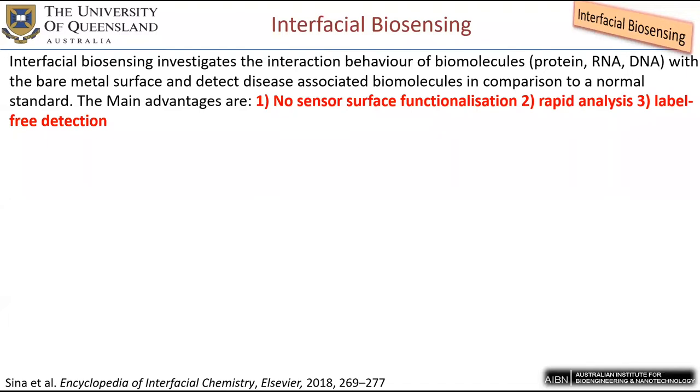Now, the main advantages of this interfacial biosensing technique are that it has no sensor surface functionalization, it is rapid because you don't need to functionalize your surface, and it's label-free. So how do we detect that?